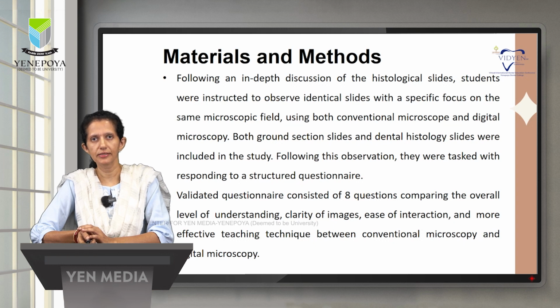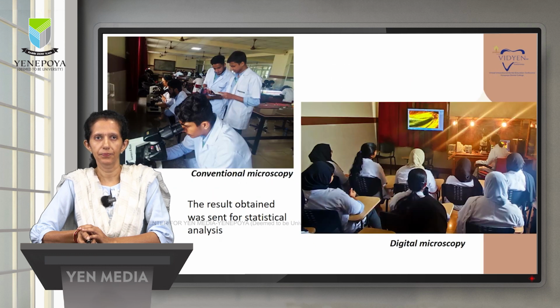Both ground section slides and dental histology slides were included in the study. Following this observation, they were asked to respond to a structured questionnaire. A validated questionnaire consisting of 8 questions compared the overall level of understanding, clarity of the image, ease of interaction and more effective teaching technique between conventional microscopy and digital microscopy. The results obtained were sent for statistical analysis.